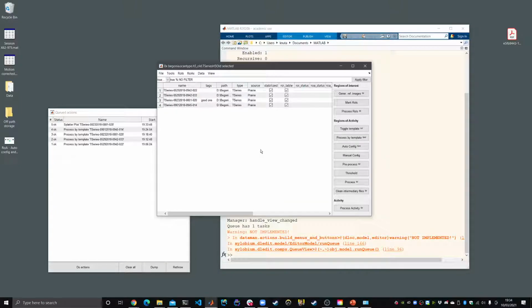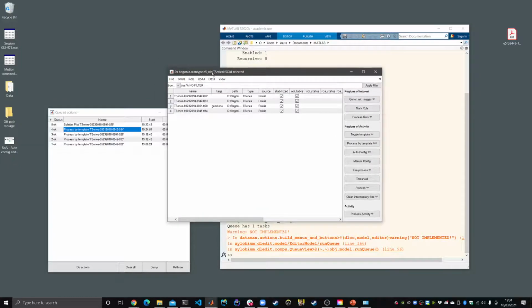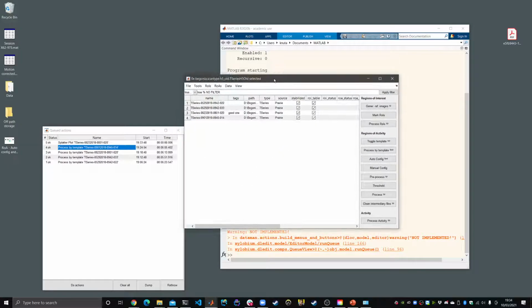So now the data has been completely processed. We are looking at roughly 6 to 6.5 minutes per T-series on a reasonably spec'd computer. The data series here is 512 by 512 pixels, recorded at 30 frames per second, and it's roughly 8,000 frames per T-series. So this is the speed that we are getting on this relatively fast computer, but it's nothing dramatic. This is the processing speed for the activity detection algorithm.